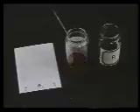If an authentic compound is available, identity is best demonstrated by the technique of co-spotting or double spotting. Since the unknown compound is usually valuable, the preferred procedure involves spotting roughly equal amounts of the unknown and the authentic compounds onto exactly the same place on the baseline, using different micropipettes, of course. Usually, the pure unknown and authentic compounds are also run on the same plate, either side of the mixed spot.